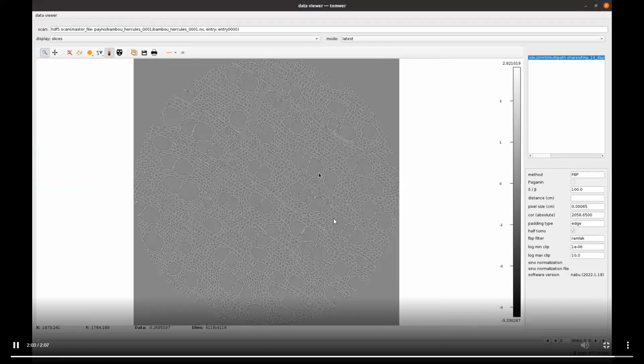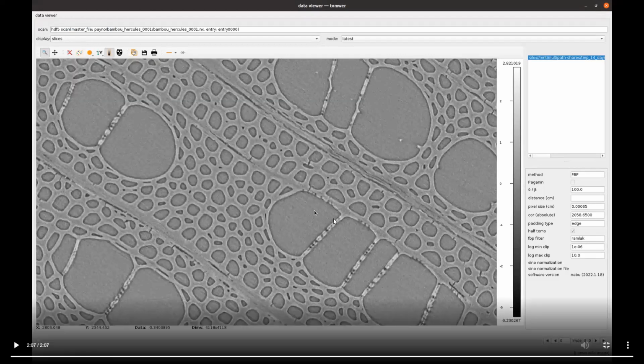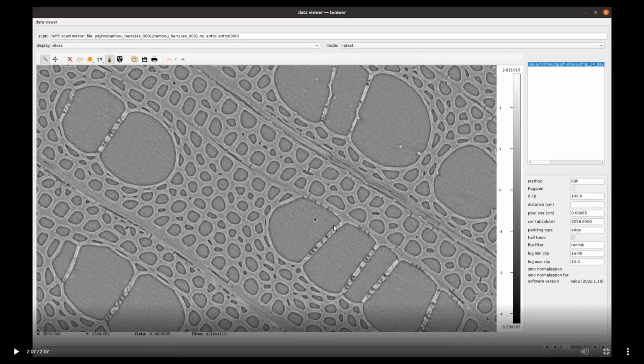And then you have a reminder of what the different settings were. You can browse it, get some profile. It's a select window for the ones who know about it. So you have kind of default tools, I would say. And that's it. You can also for sure go for the volume and things like this. I will just go back here.